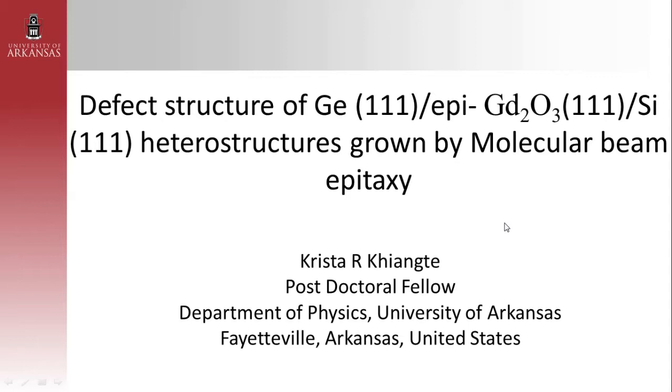Since XRD works on the principle of kinematic scattering of X-rays, electron microscopy also works on the principle of kinematic scattering of electrons. So understanding both helps a lot in characterizing any samples that you are working on.